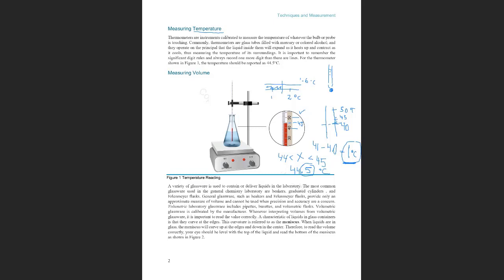But what happens if you have a thermometer with, let's say, 10 Celsius and 20 Celsius, and your temperature marks here? You look at the difference between two close markings, and you know the difference is just 10. It jumps from 10 to 20, so 20 minus 10 is 10.